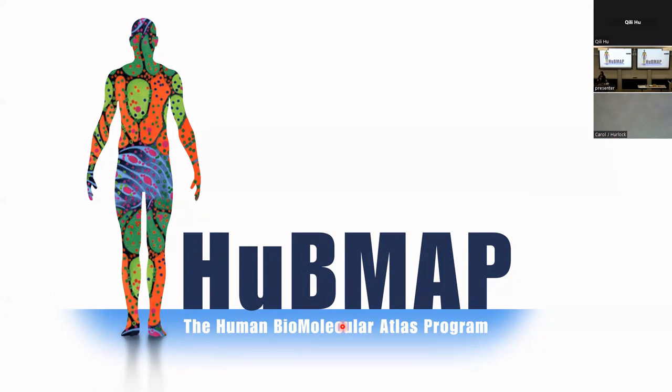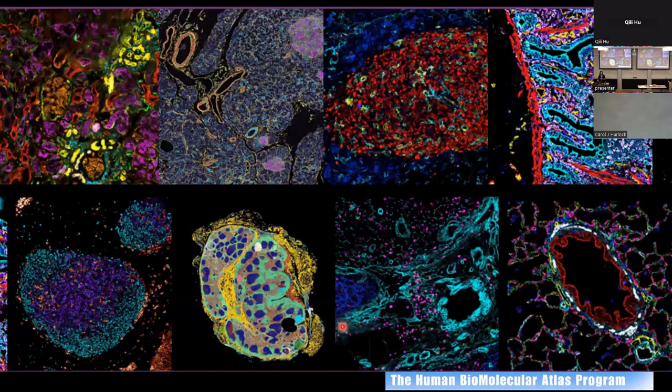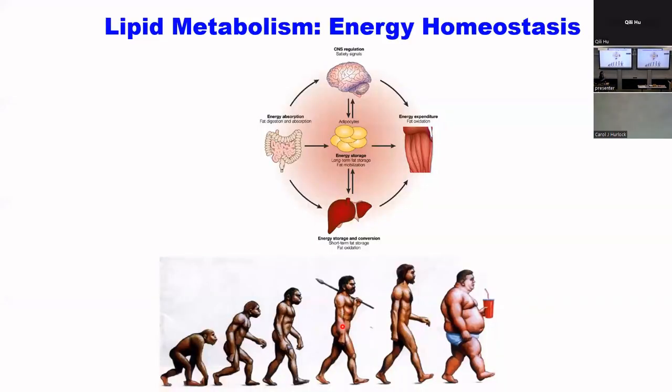And even for people who are interested in disease detection, they have a good reference, not only for brain, but also for internal guts. These are image examples taken by our colleagues in this HuBMAP program. You can see a lot of colorful protein molecules from different organ tissues, including intestines or even lymph nodes, and some are from tonsil or kidney or lung. But you can see that most of the molecules are protein. So we can visualize protein easily, but the imaging technology for visualization of these fat molecules is very limited. We cannot easily target the fat molecule in the body.